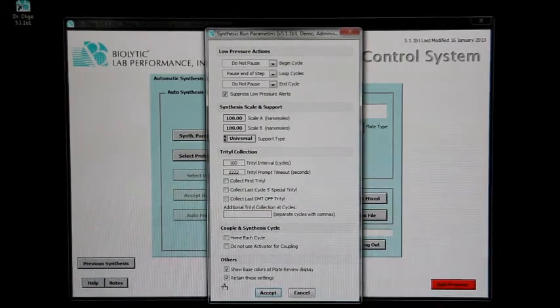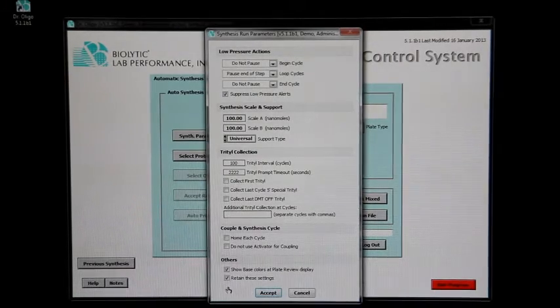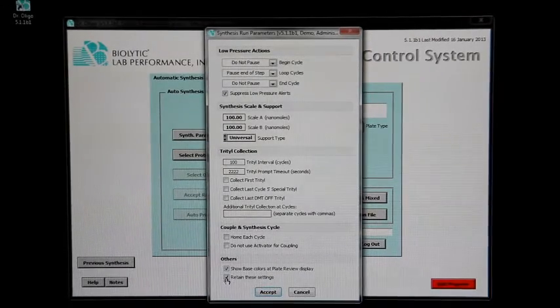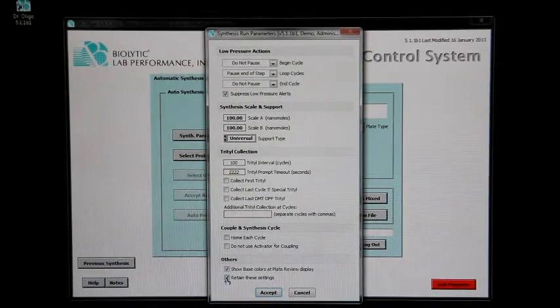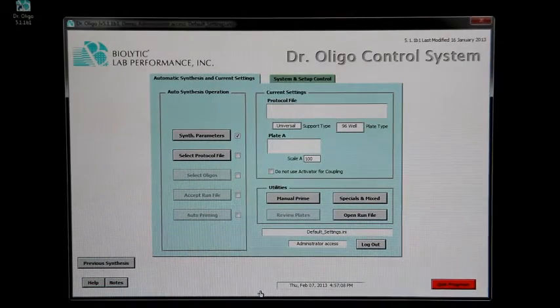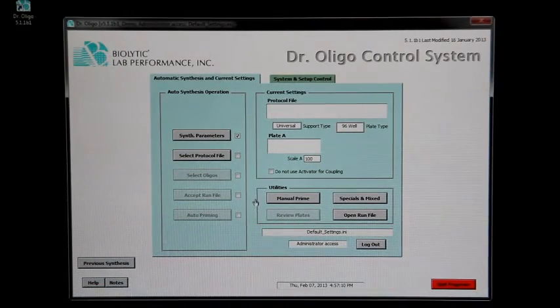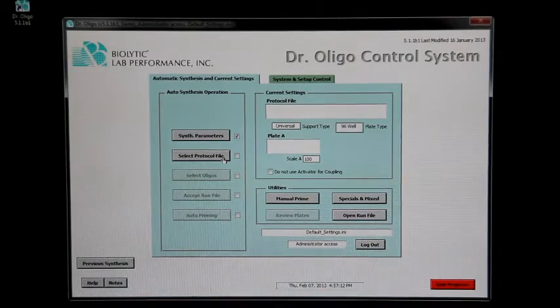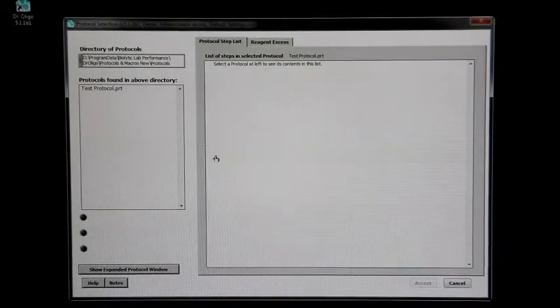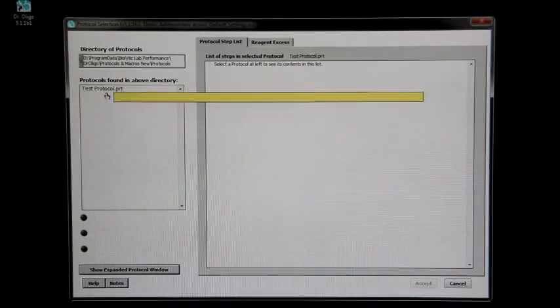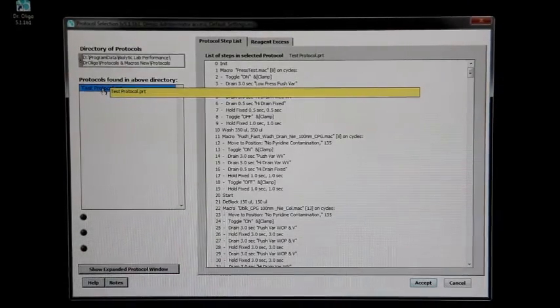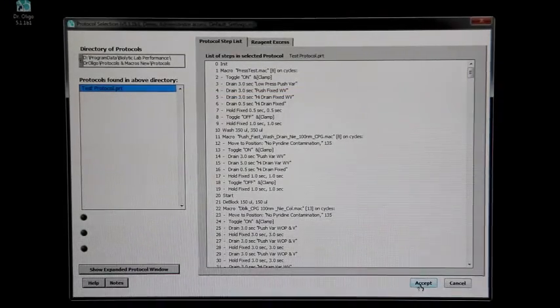These options may be set once and then retained automatically for future syntheses. To select the protocol to use, click select protocol file. Select the protocol from the list and click accept.